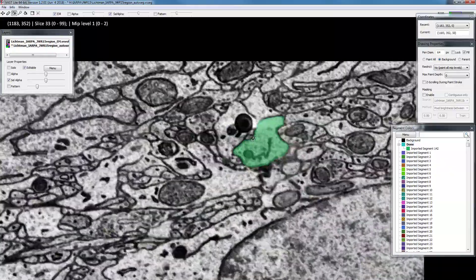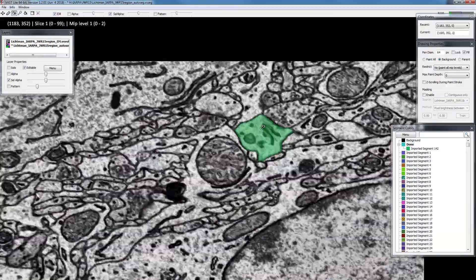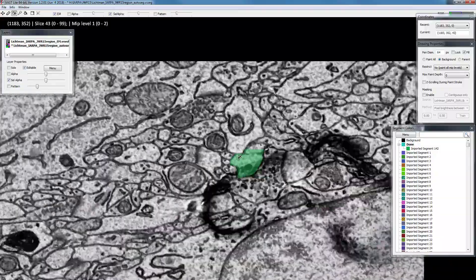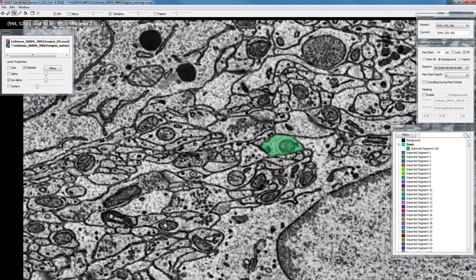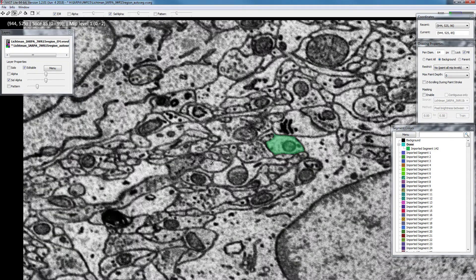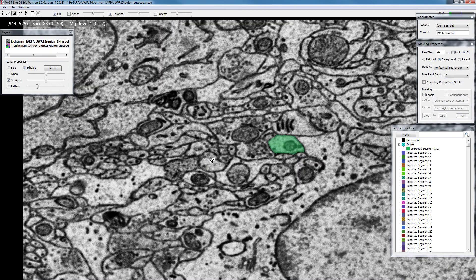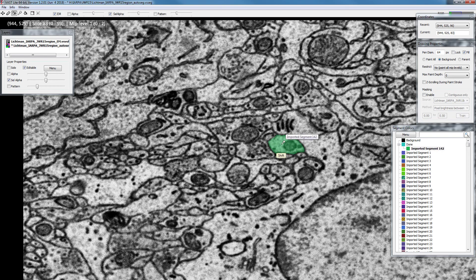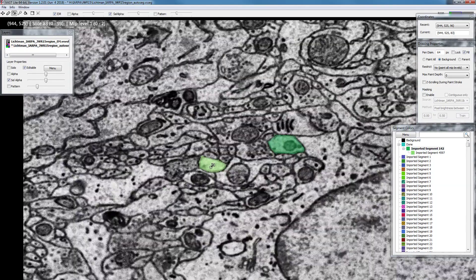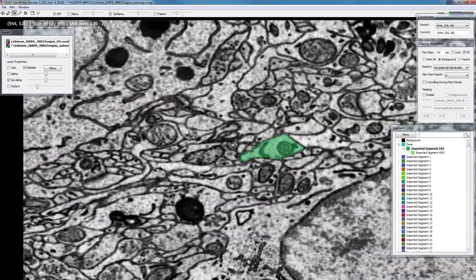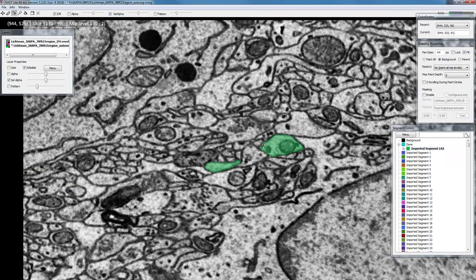This looks like it's a dendrite — there's a synapse here for example. Going down, you can see there is a branch coming off that disappears, but it is actually a spine and the spine head is right here, so we can collect that. We select the object as the target and then click the spine head — it has now been collected. It is still a different segment originally, but it appears as the same color because it's inside this folder and the folder is closed. If I open the folder you can see the original segment color and where it was split.